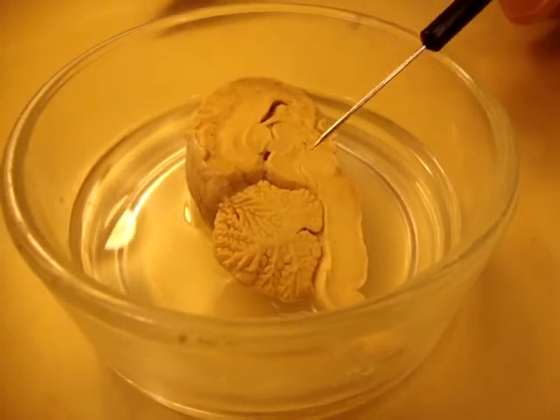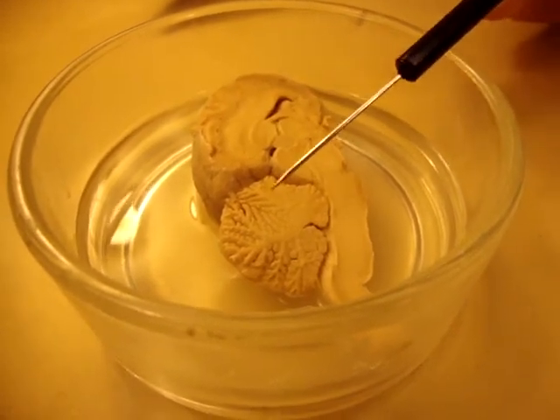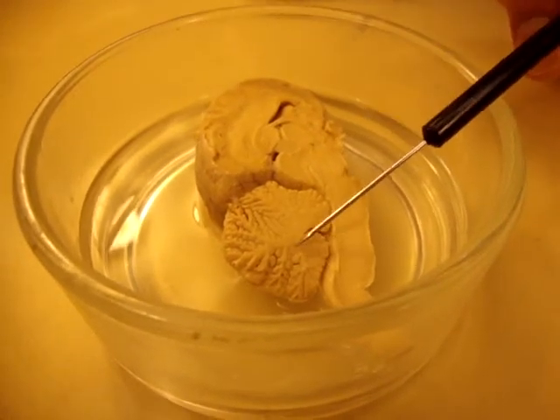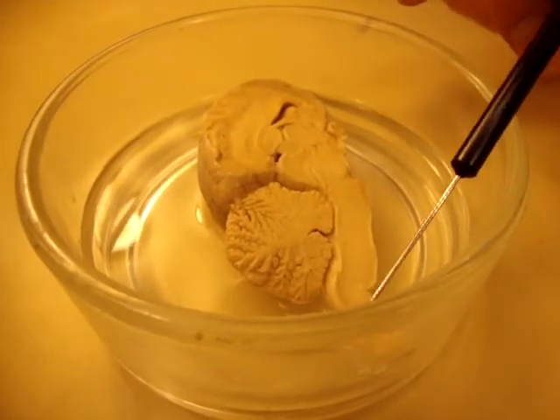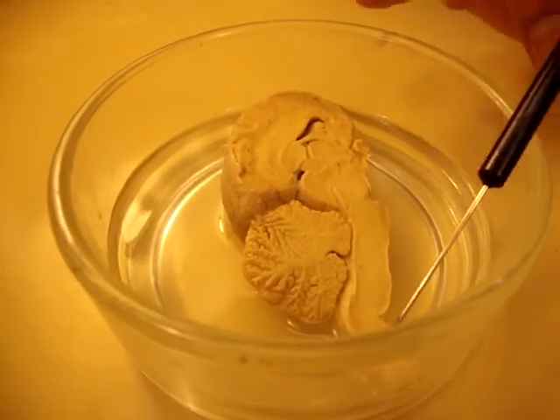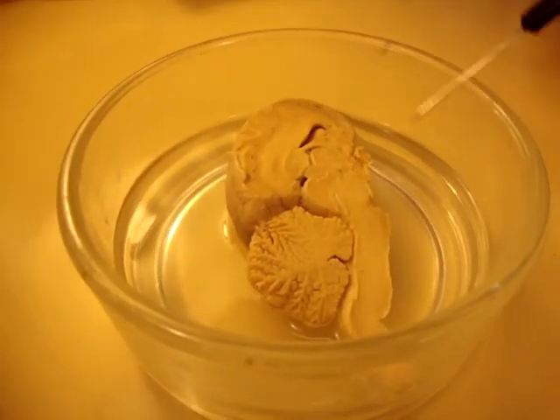Then you move back into the metencephalon, which is your cerebellum, essentially. Yeah, the tree of life. And then this little swatch down here is your medulla oblongata. Cool. Awesome. Thank you.